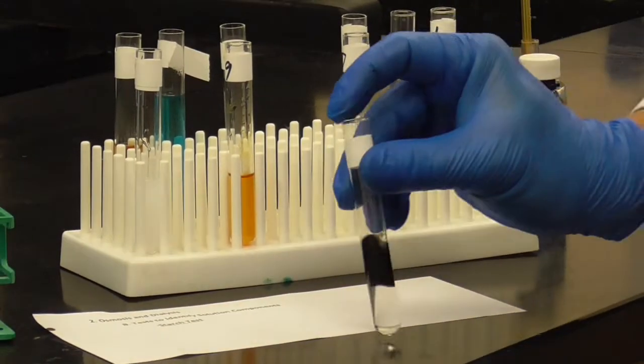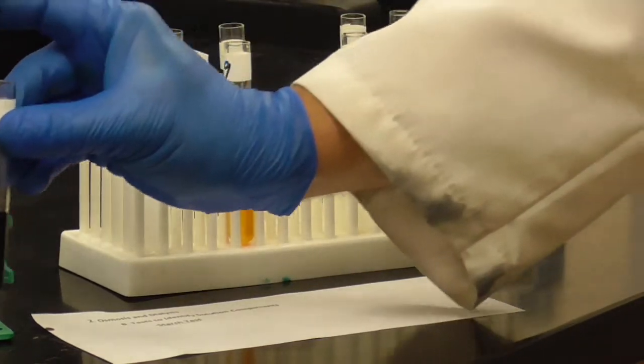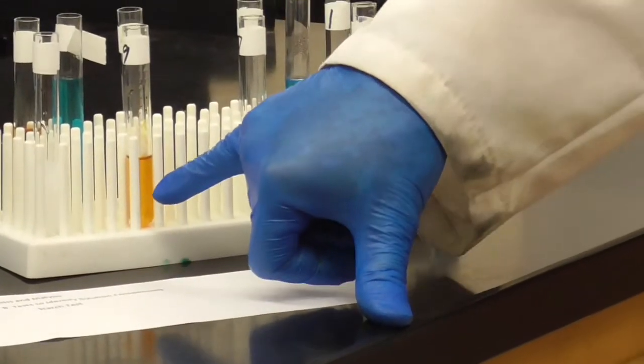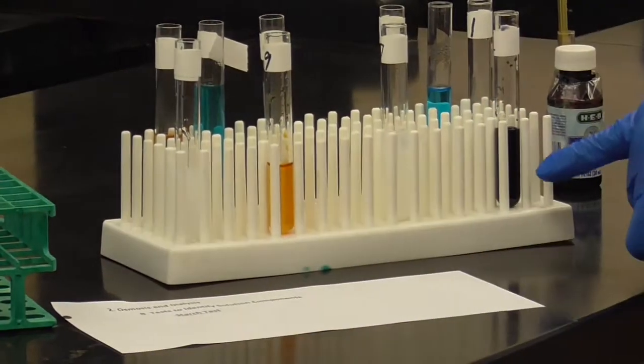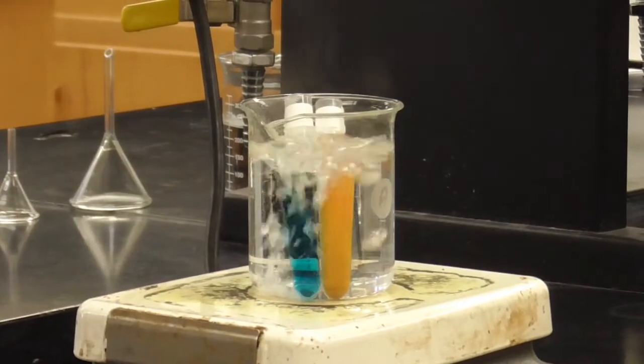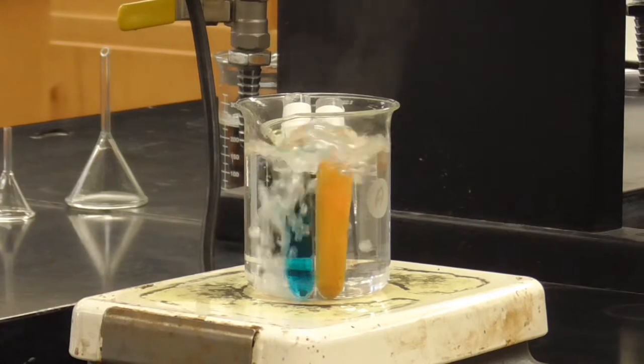Looks quite a bit different. And so the inside of the bag was definitely positive for starch. So looks like starch never made it across that. It stayed in the bag the whole time. All right, so lastly, this has already started to change, at least one of them. We'll give it the full 3 to 5 minutes, and then we'll take a look at it.